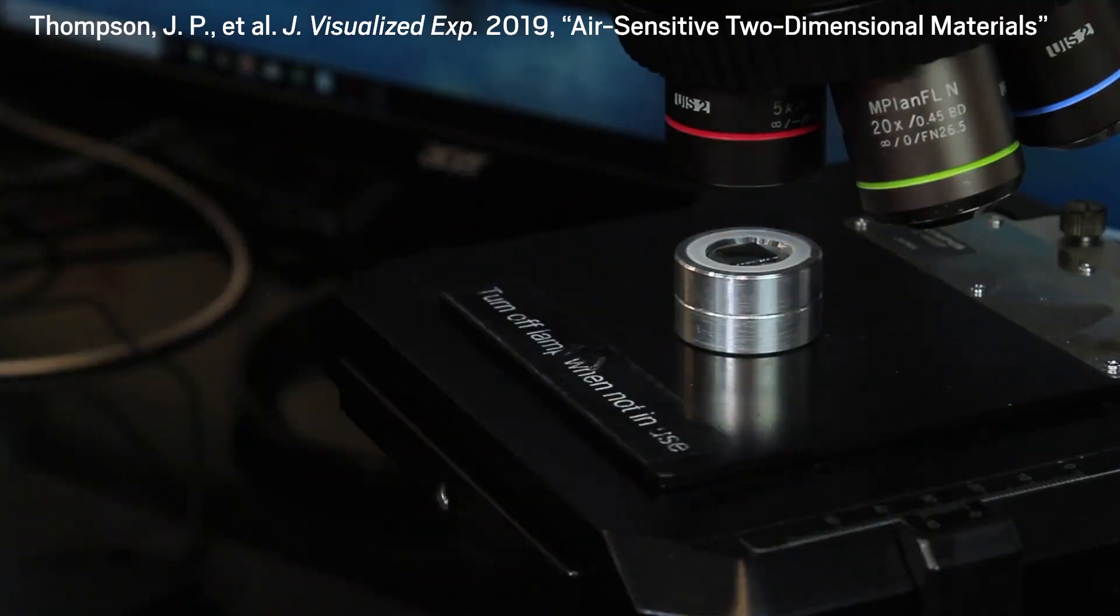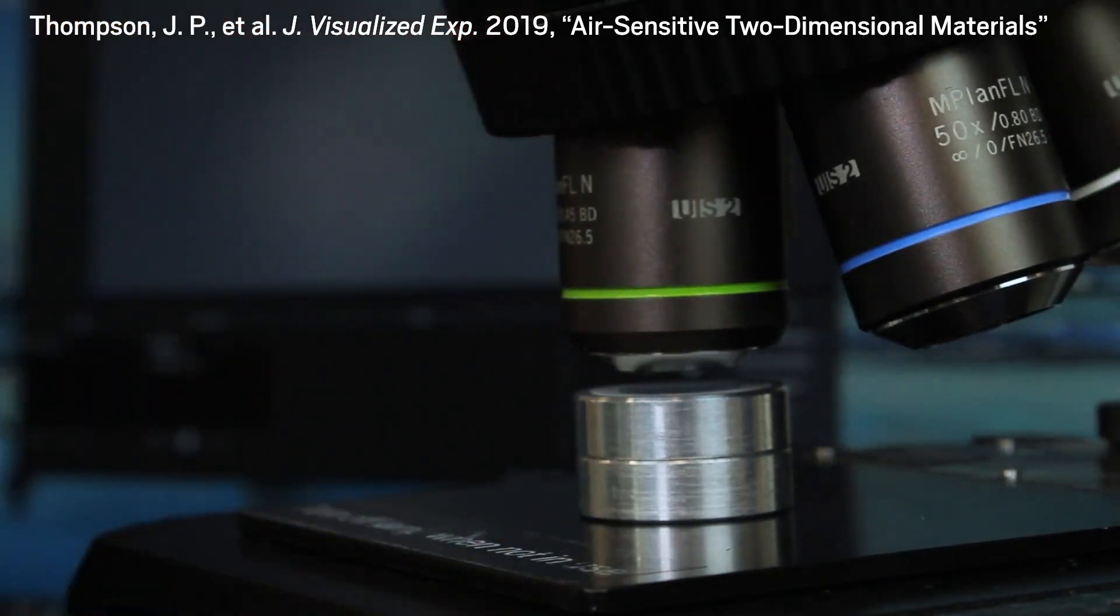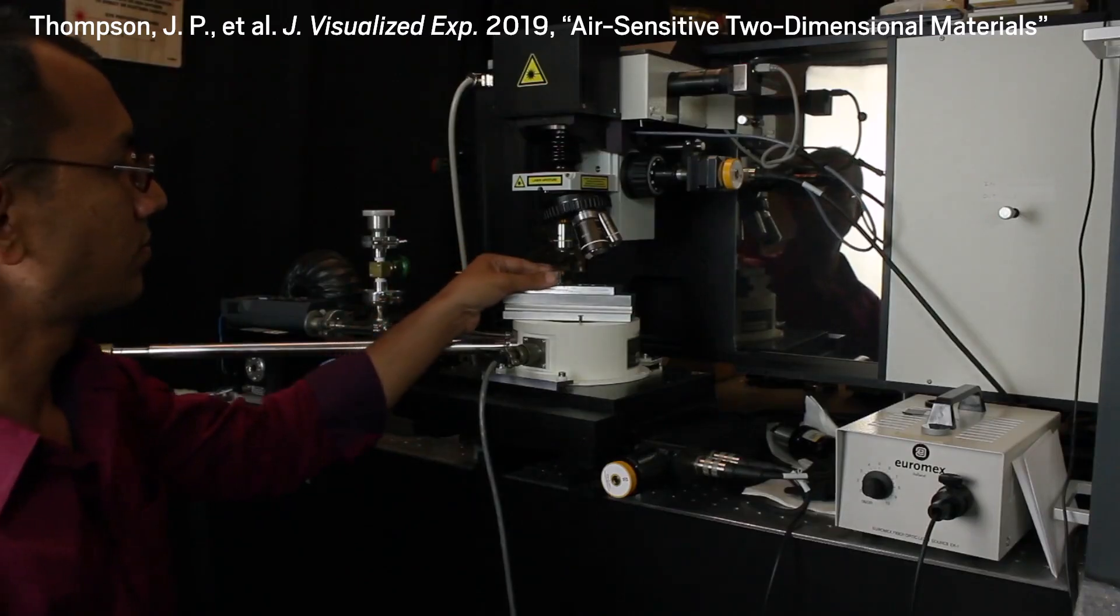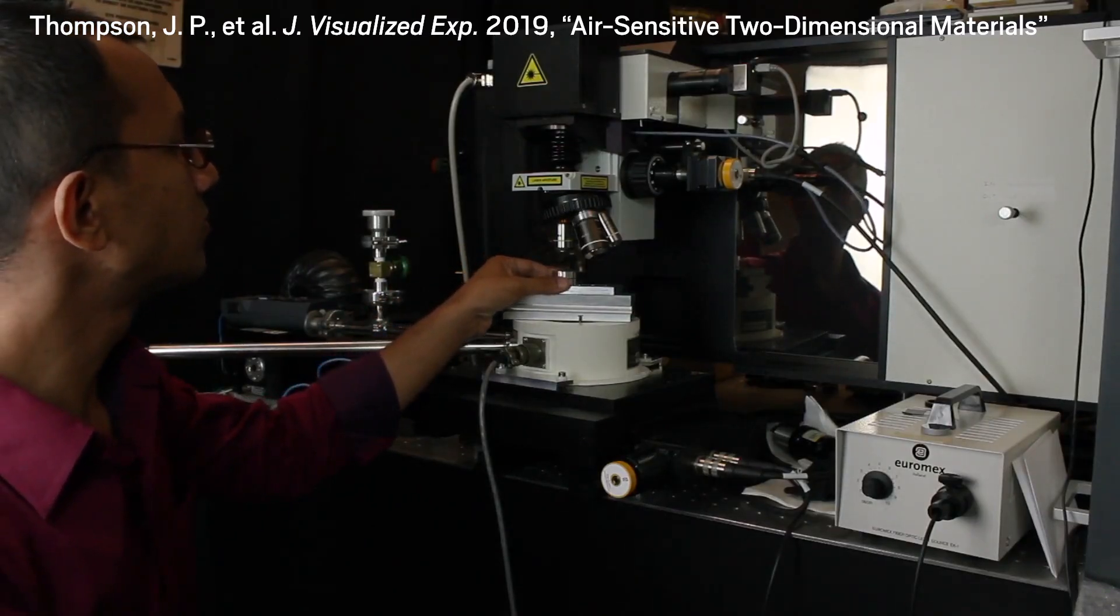With this combined method, the Arkansas group was able to get larger flakes and more of them, 6 to 10 times more material than usual, and they were able to image the flakes with optical microscopy and polarized Raman spectroscopy without the flakes degrading.